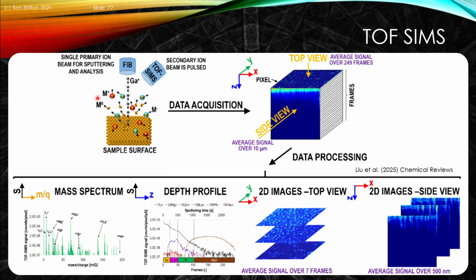But the SIMS-based approach does enable us to scan across our material, collect the TOF SIMS data, get the mass spectra, arrange it, and characterize the ions nicely. You can do depth profiling by being very careful of how you do this. Once you do this, you can build up a total volume to image and understand material systems. And again, I stress this can be very nice for things like battery materials in particular, if done carefully.